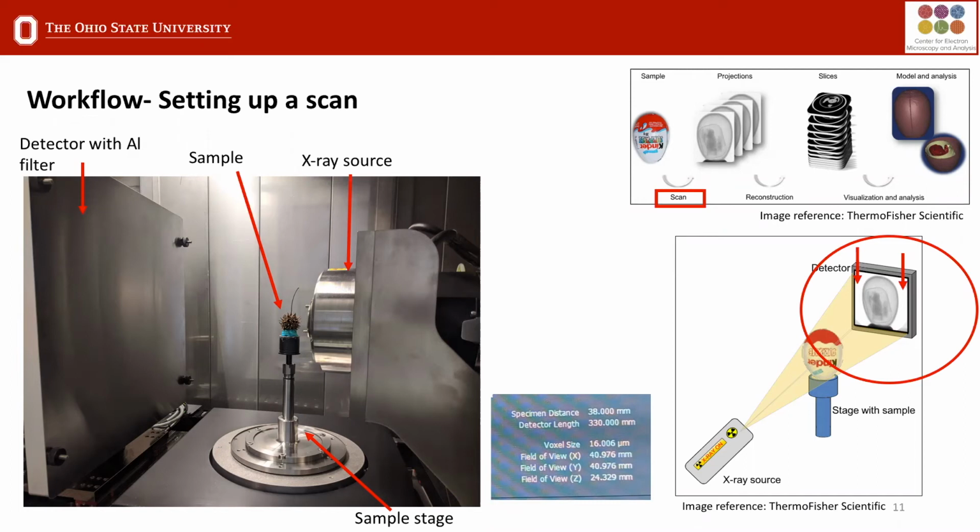I also chose to use a space-filling helical trajectory, and I set the exposure time. And I also set all other required parameters. So this full field scan ended up taking around 2.5 hours.